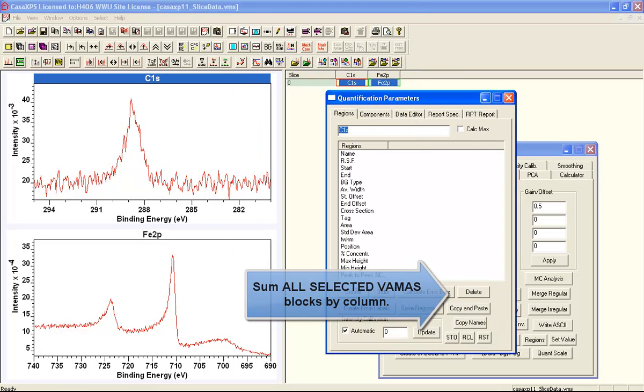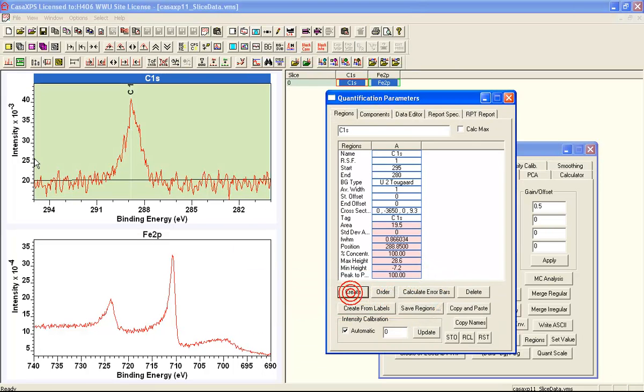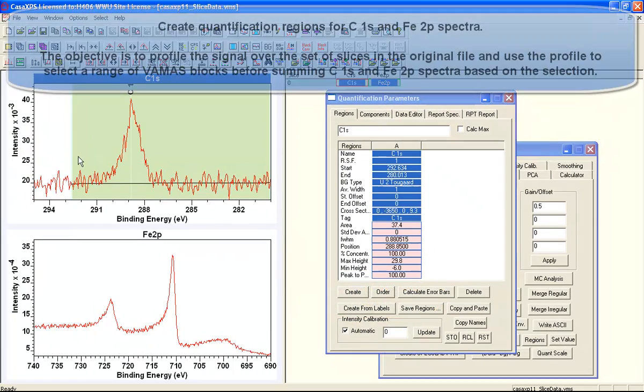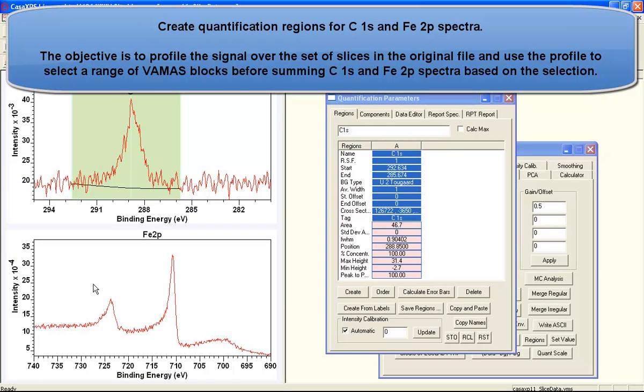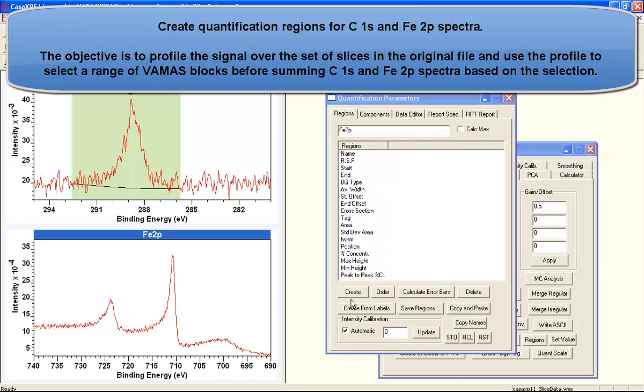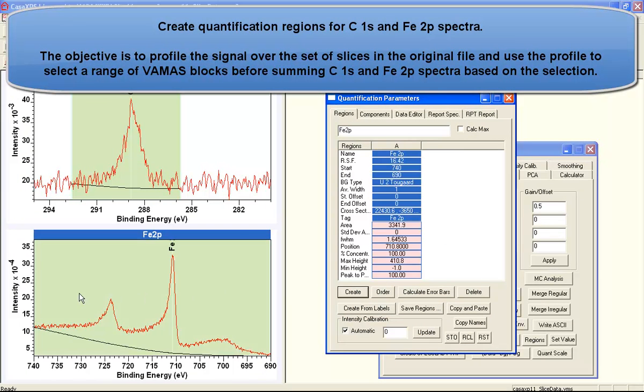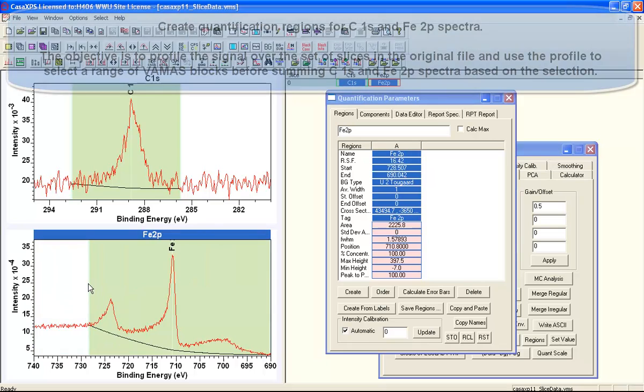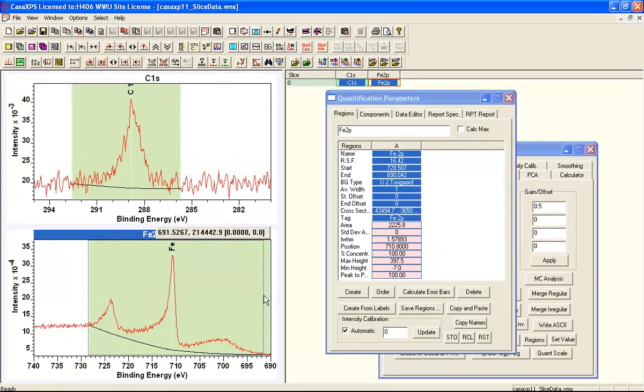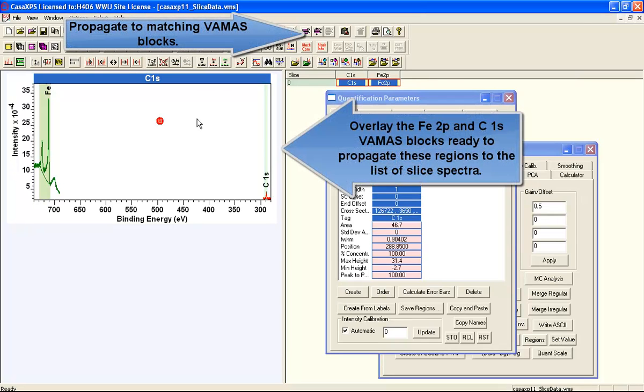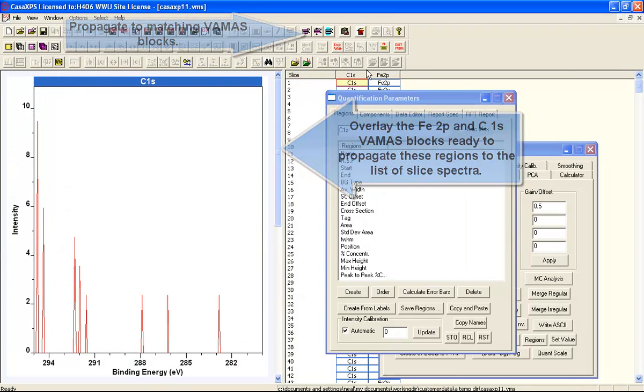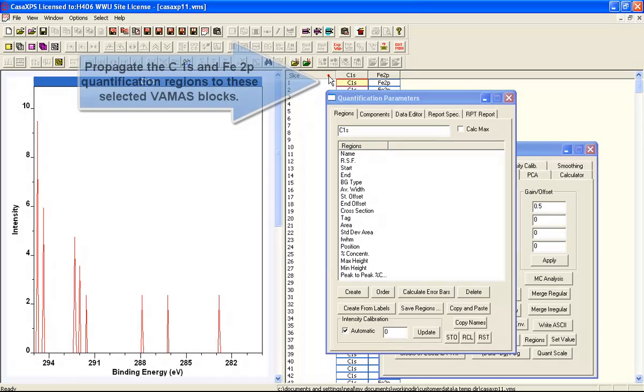The test data property page provides the means by which spectra can be summed when they have been acquired in this way. You've got a consistent energy bin and a consistent measurement, so these are effectively identical measurements that have been saved in a data file.